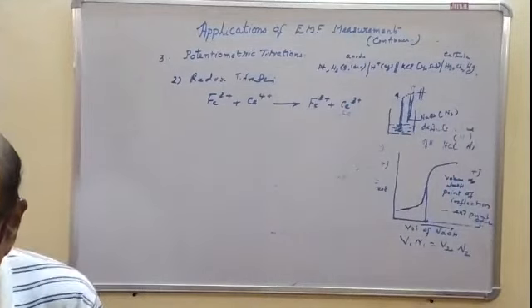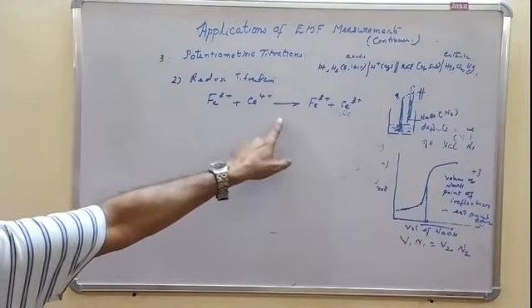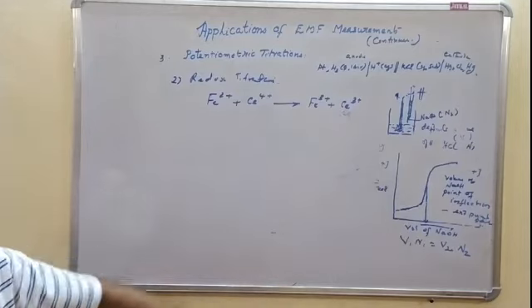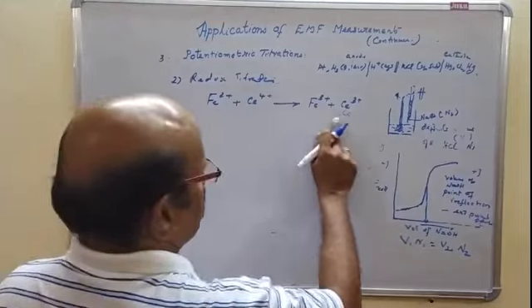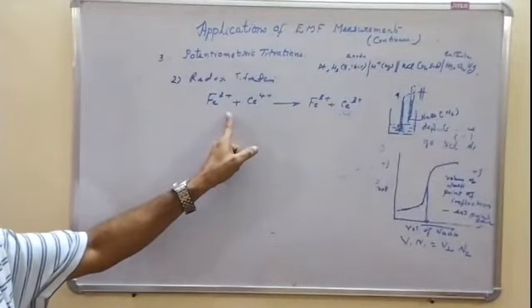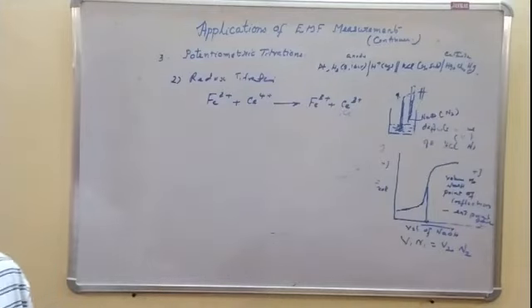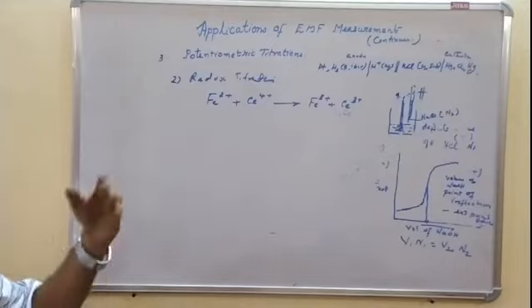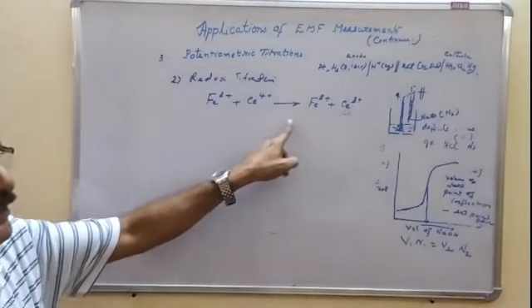Here, the reaction is the titration of Fe2+ with Ce4+, which react to give Fe3+ and Ce3+. It's an example of a typical redox titration. We can follow this redox titration by employing an indicator electrode like a platinum electrode that will respond to the ferrous-ferric redox change in potential.